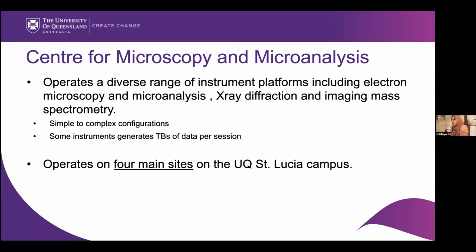These instruments range from very simple to very complex configurations. Some of them generate a huge amount of data per session, and that's where the complexity of challenges is at its peak. Those are the things I needed to highlight before we explain what Pitschi is.